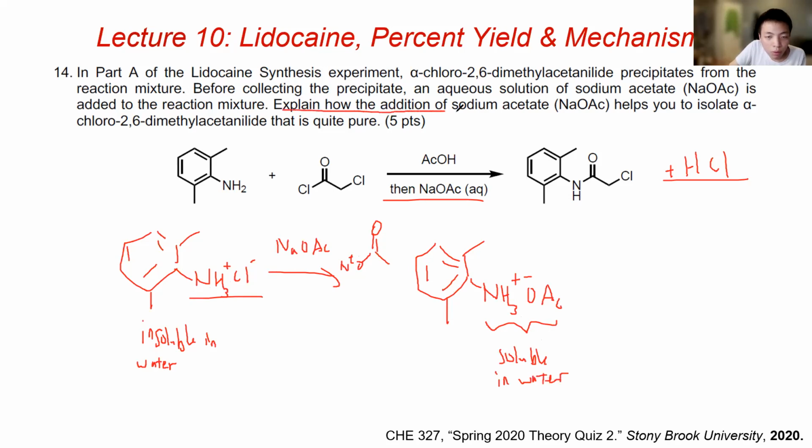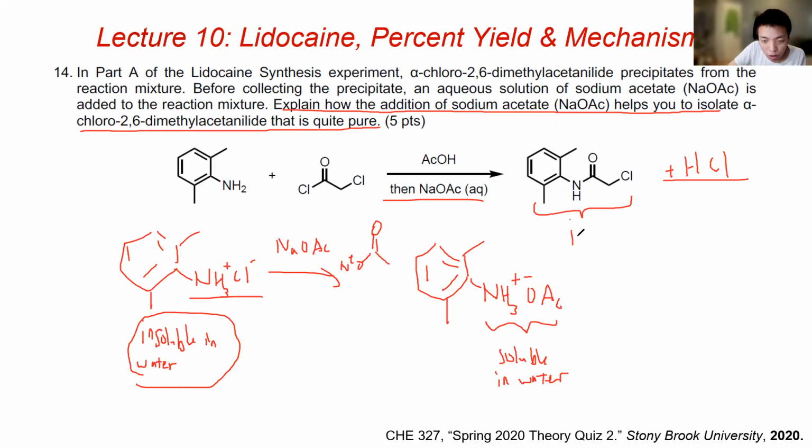And that's why when we added sodium acetate, NaOAc is able to get our product more pure by removing this impurity, because this one is also insoluble in water.